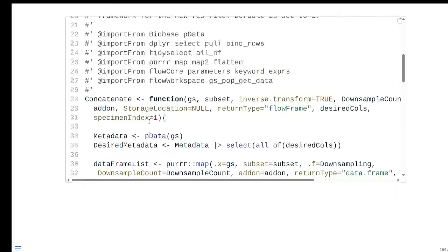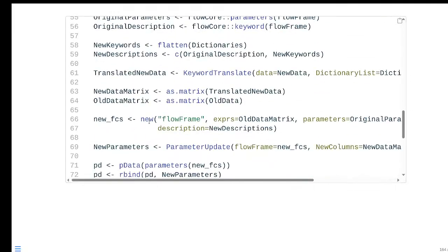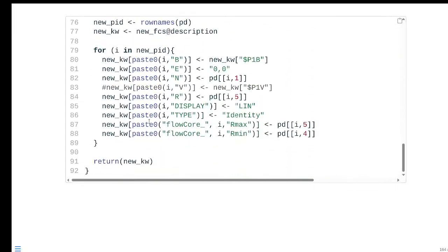So, I don't remember the exact origin of this one back in the day. I had encountered it probably while deep diving this in the first initial attempt, and this is the code that basically works within the for loop. So remember, each of these is the new P number certain value. It's basically within the for loop, it might be P43, P44, P45, P46. It iterates through them equivalently.